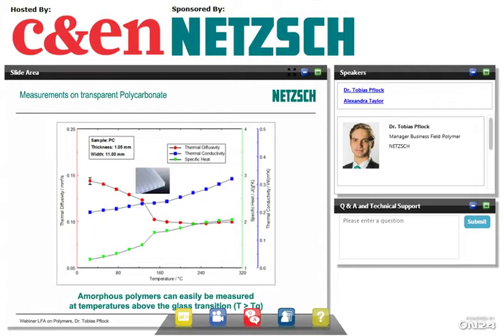Can this technique replace DSC? It depends on what you want to do. You can look at specific heat capacity also with this device, and sometimes the accuracy of the specific heat capacity you get with the LFA is indeed sufficient to get a reasonable specific heat capacity of your sample.